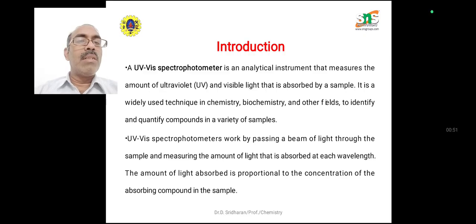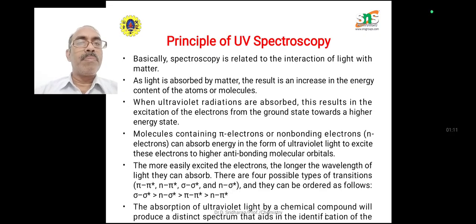It works by passing a beam of light through the sample and measuring the amount of light that is absorbed at each wavelength. The amount of light absorbed is proportional to the concentration of the absorbing compound in the sample.